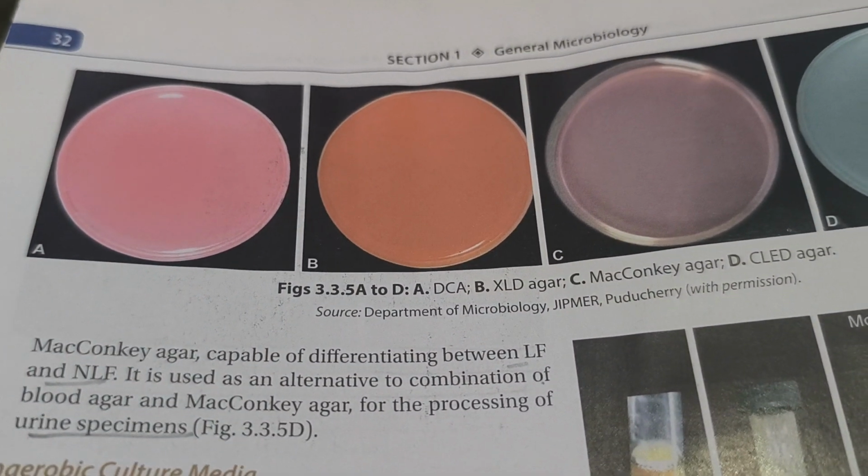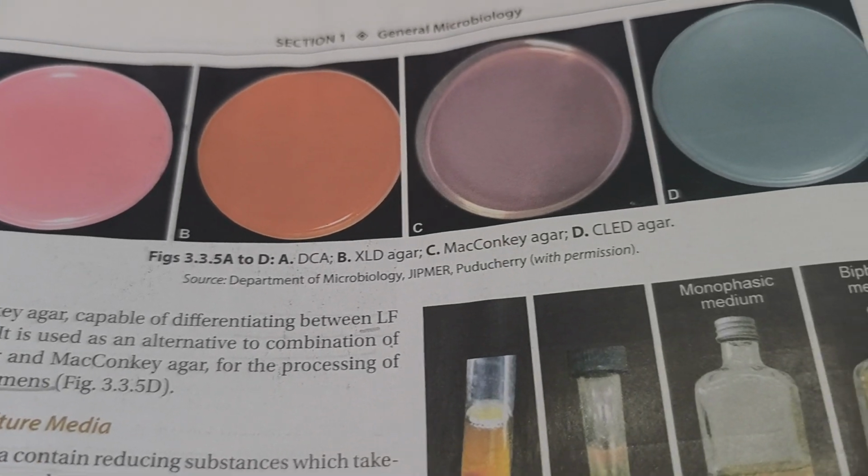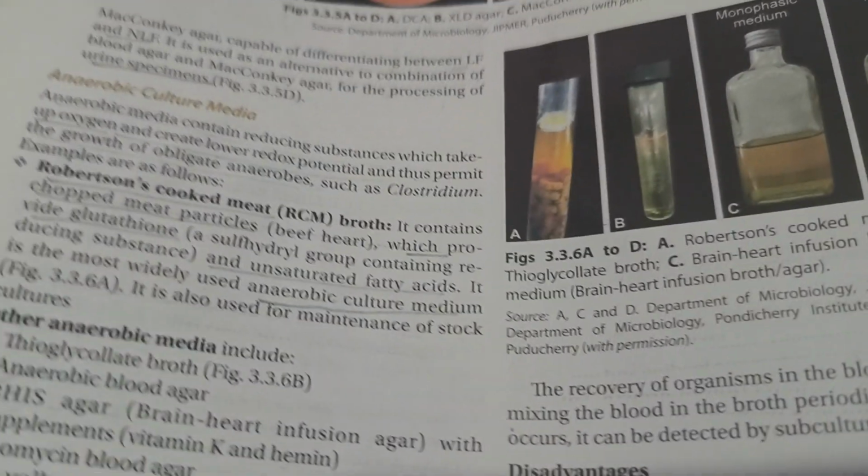Figure A of DCA, Figure B of XLD, Figure C of MacConkey agar and Figure D of CLED.